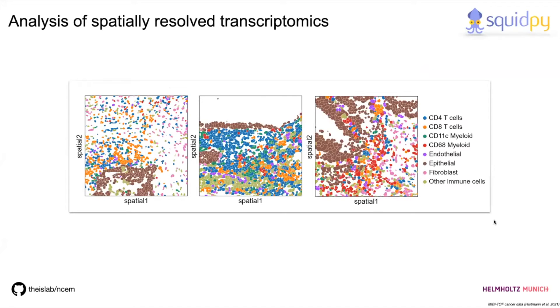I will now guide you through an example tailored around one data set explored in Hannah's tutorial, which is on colorectal cancer. With SquidPy or other spatial transcriptomic data analysis tools, you can investigate the spatial distribution of different cells in their original spatial location. You can directly see that there are epithelial cells, which in this case are cancer cells, clustered together forming cancer regions, and T cells scattered around these cancer cells.